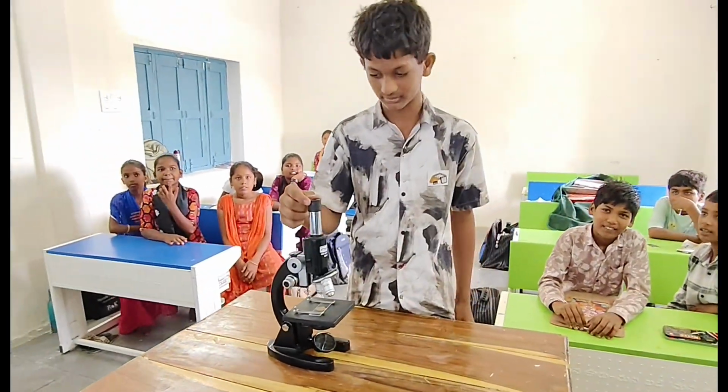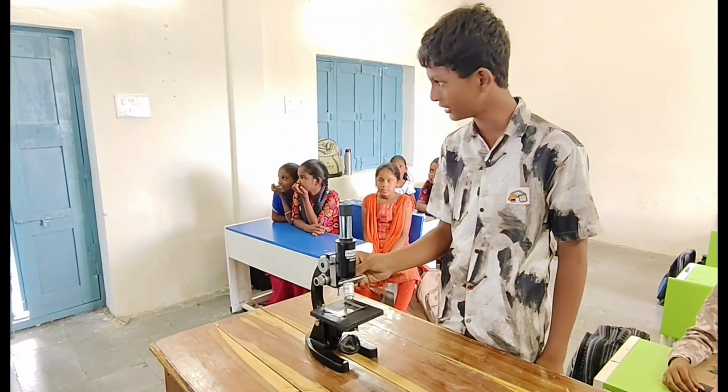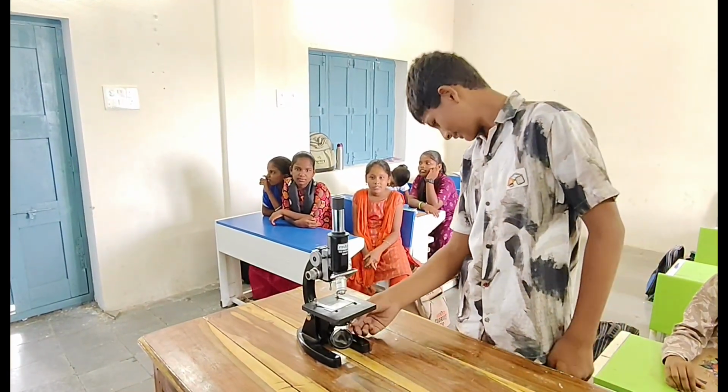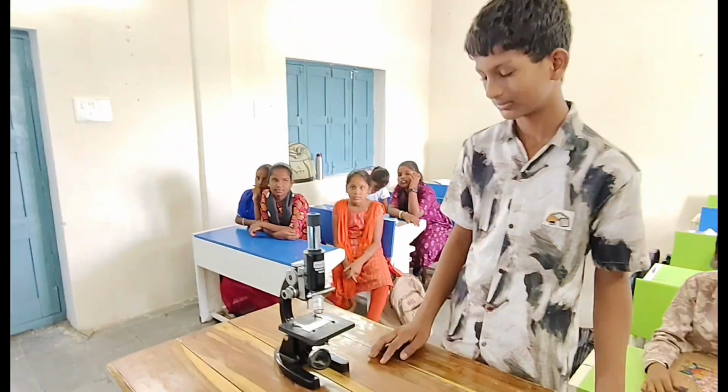This is eyepiece, tube, coarse adjustment, fine adjustment, objective lens, arm, stage, clip, condenser, reflector, base. Very good. Go.